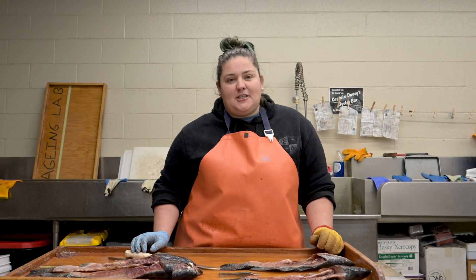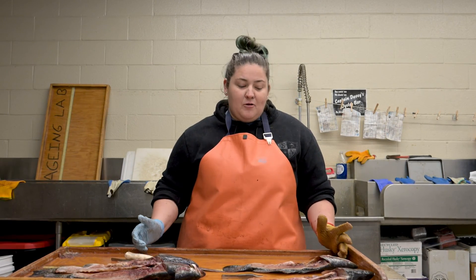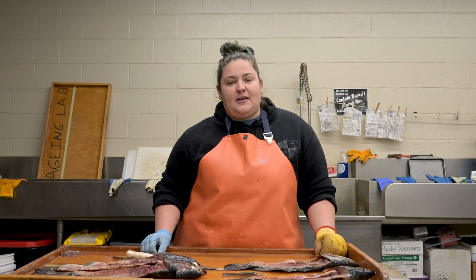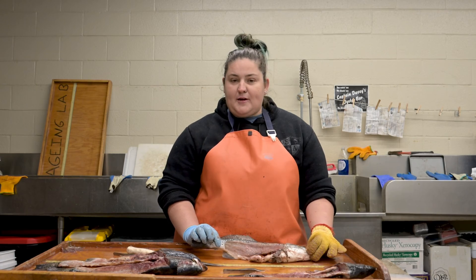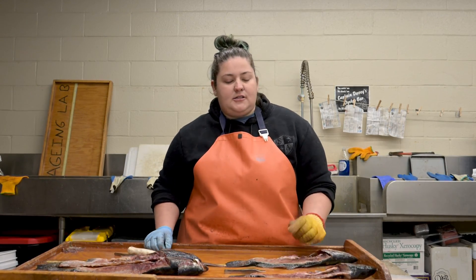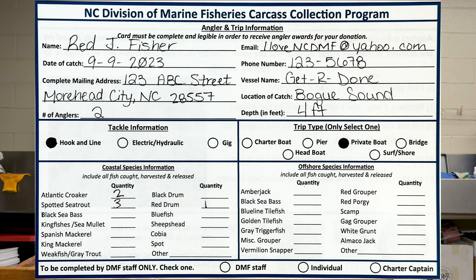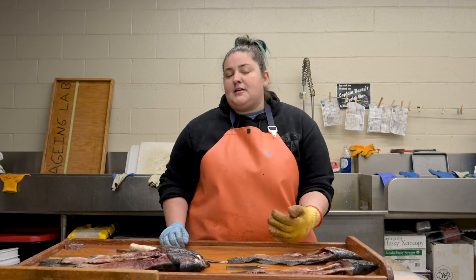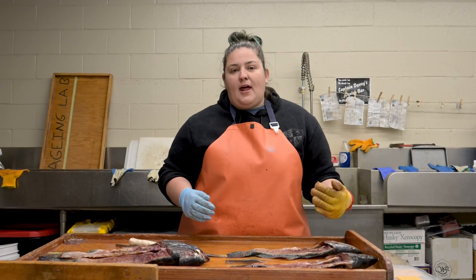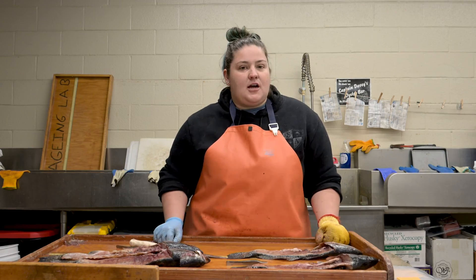Hey, I'm Amanda. I'm the Sport Fishing Specialist with the North Carolina Division of Marine Fisheries and today we're working up some of the fish that have been donated to our carcass collection program. What we have here are speckled trout. Our anglers filled out a catch card, left them in a bag in one of our freezers. We're going to take the length, determine if it's a male or a female, and I'm going to take out the otoliths, which we use for aging, which then goes into our stock assessments.